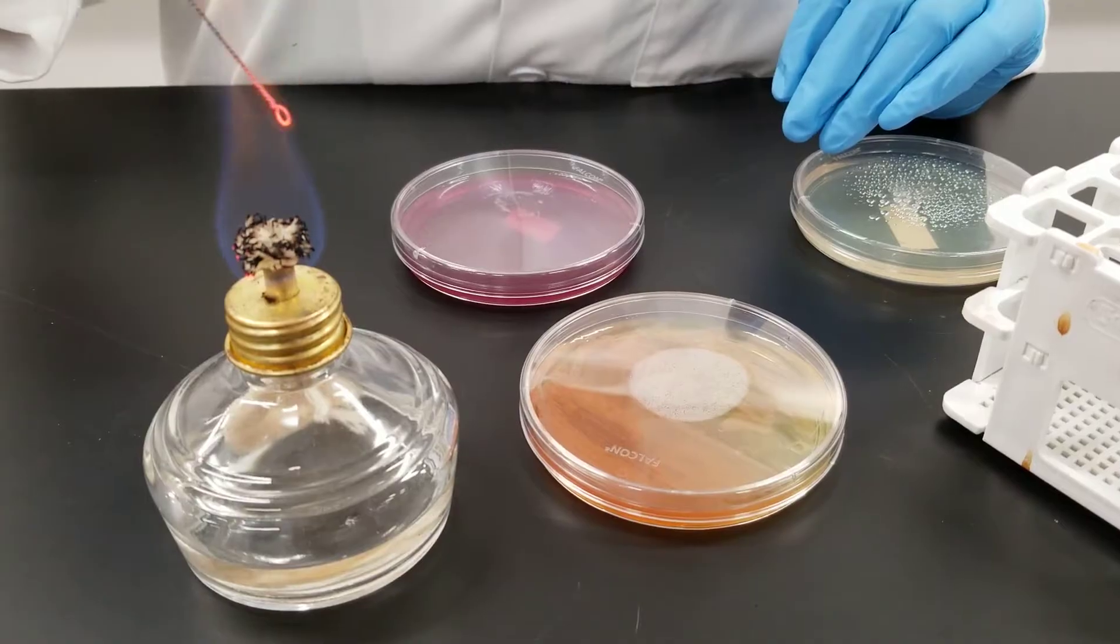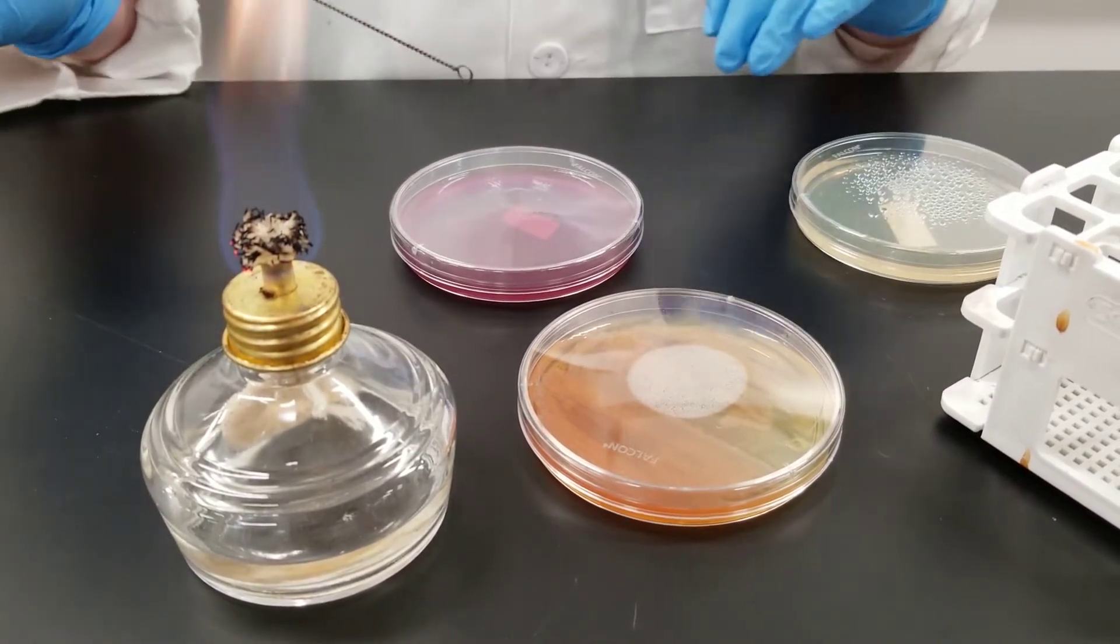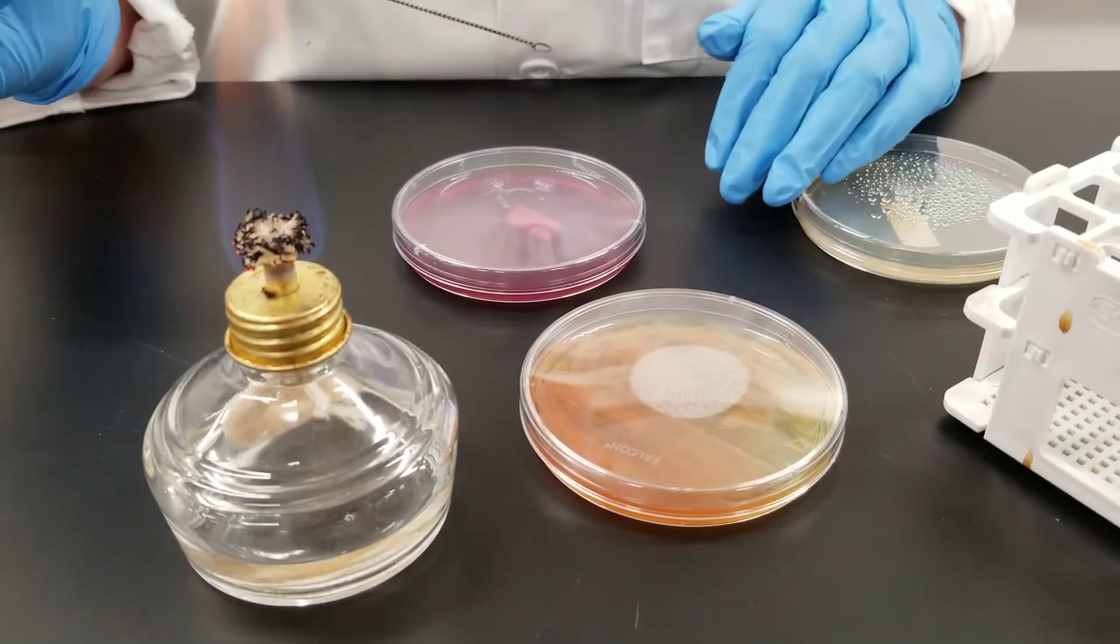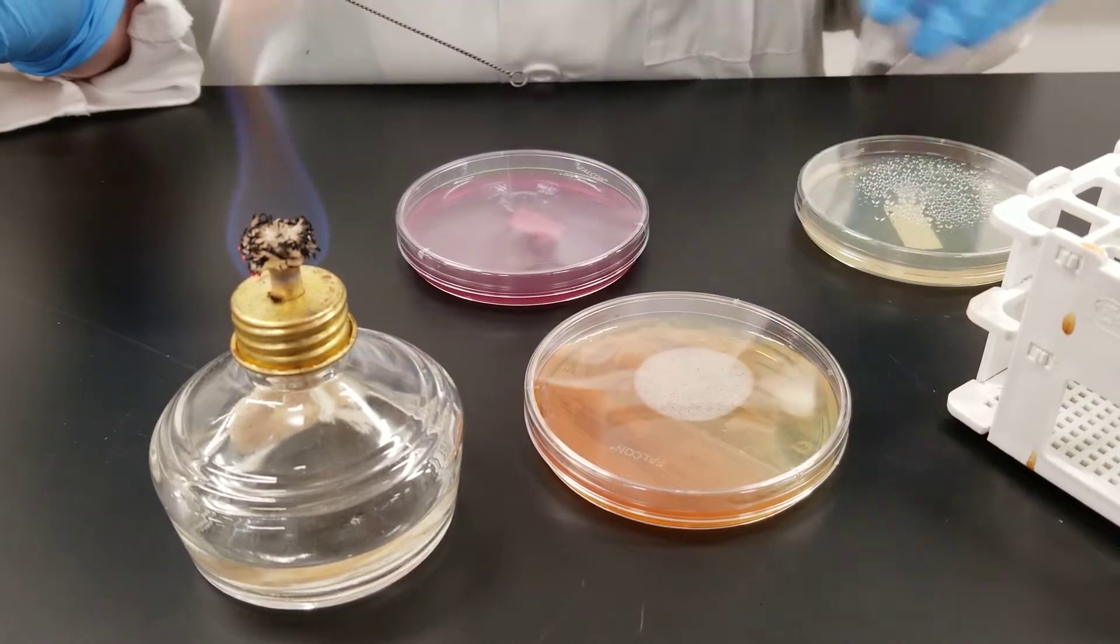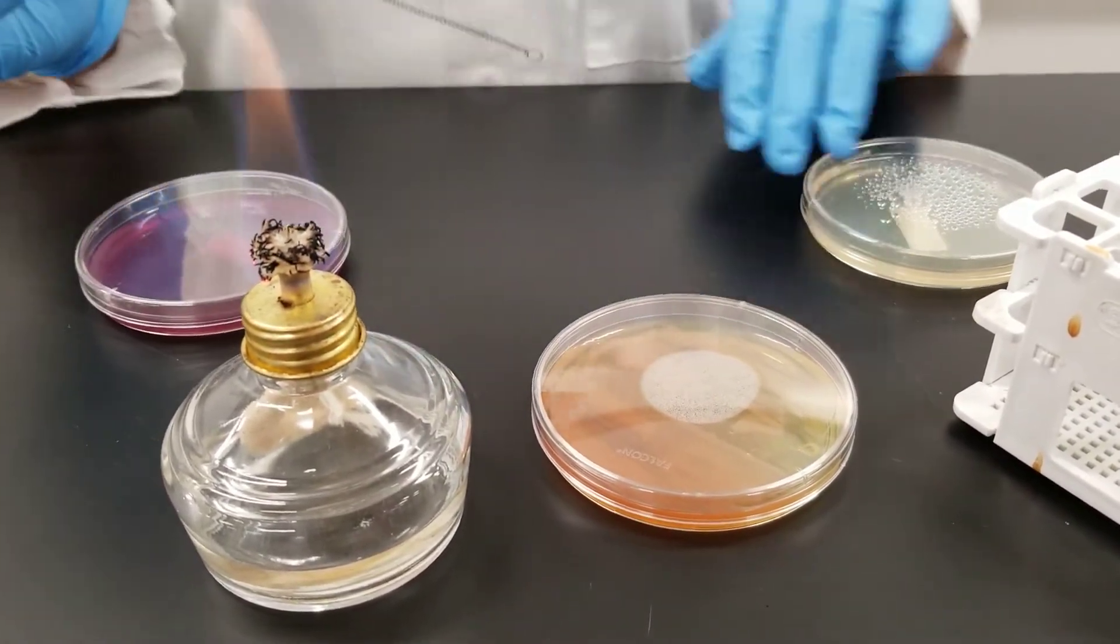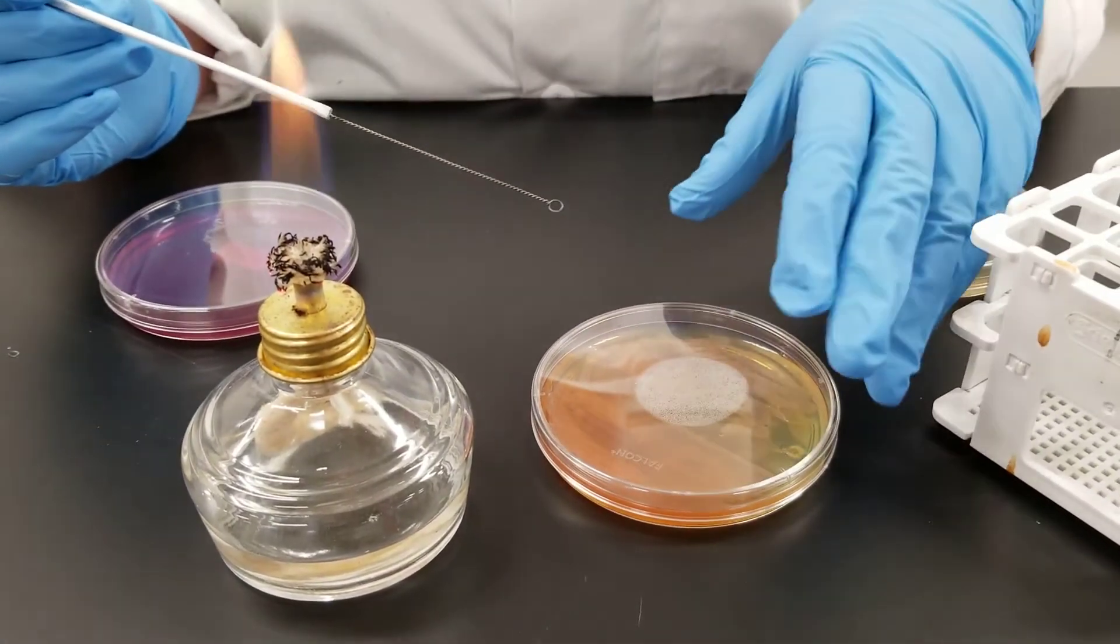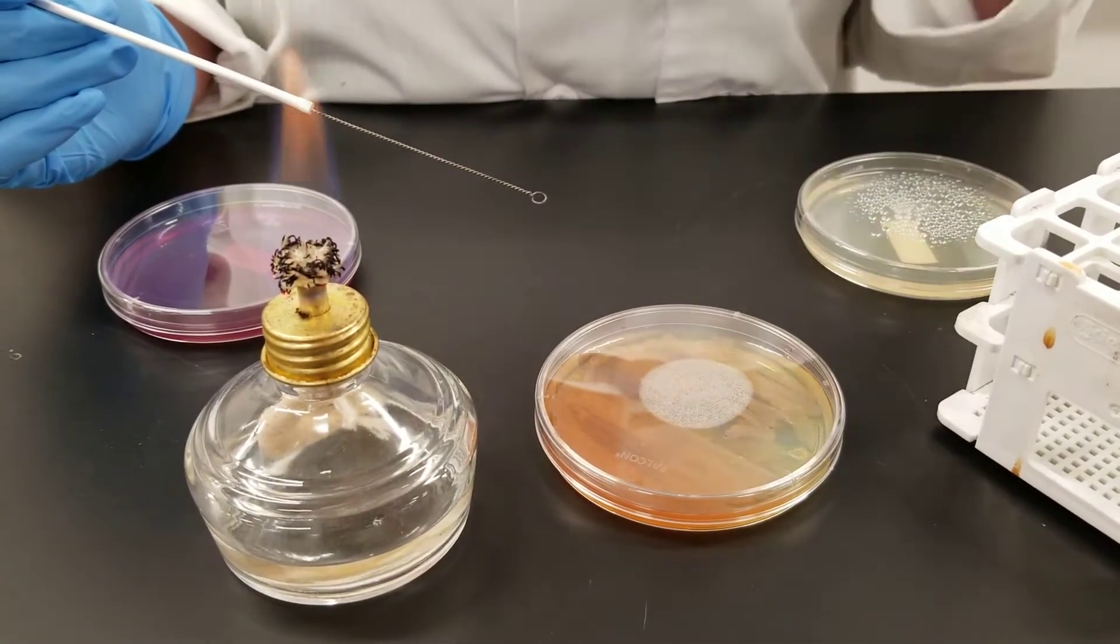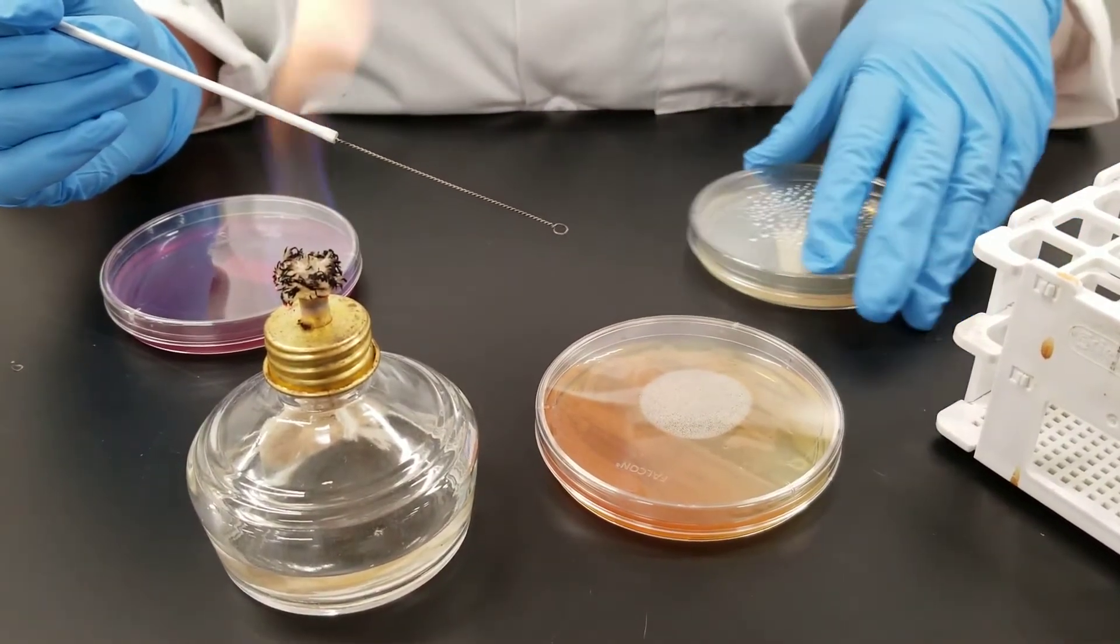Hold it in the flame for a bit, then let it cool. You do not want to go directly into the sample because you will basically hear a sizzling which means you've just killed everything. So let it cool a bit. Do not be waving it around in the air because you can pick up contamination. You always want to be working within six to eight inches of your flame. That is considered your sterile area. You move way outside of that and you're no longer in the sterile area.